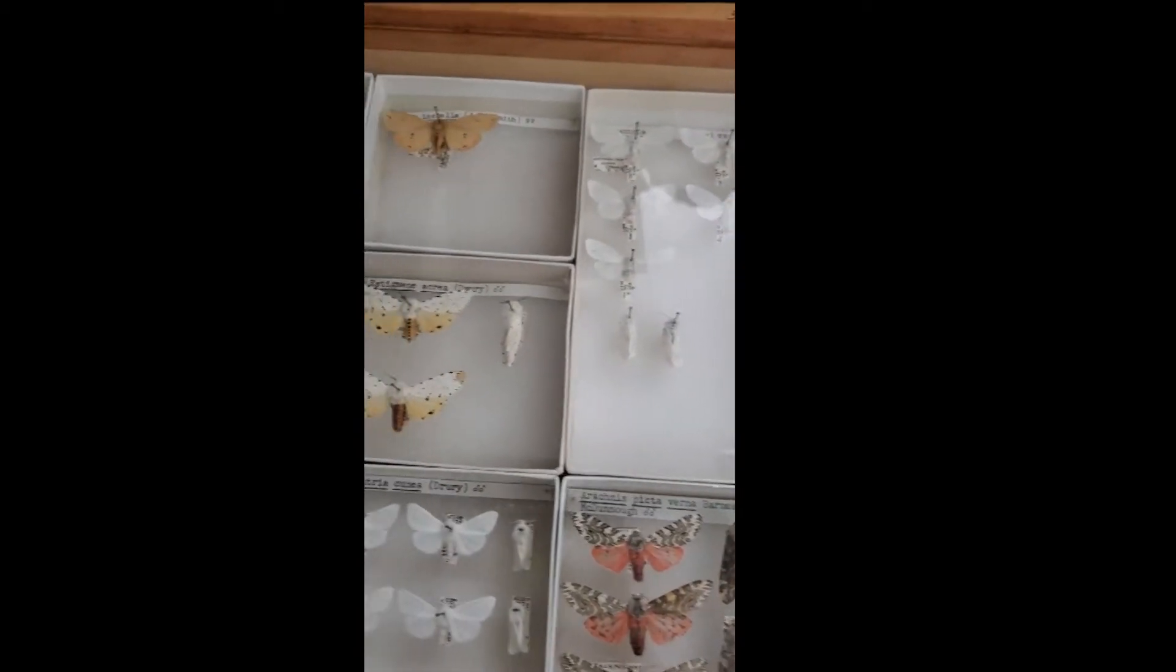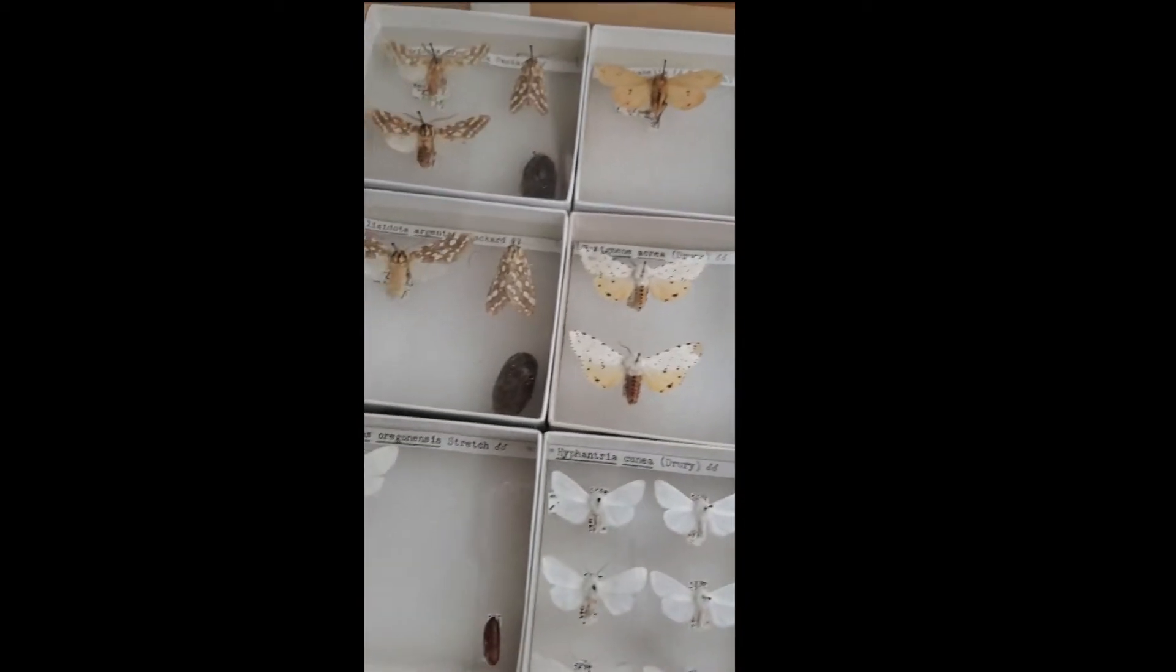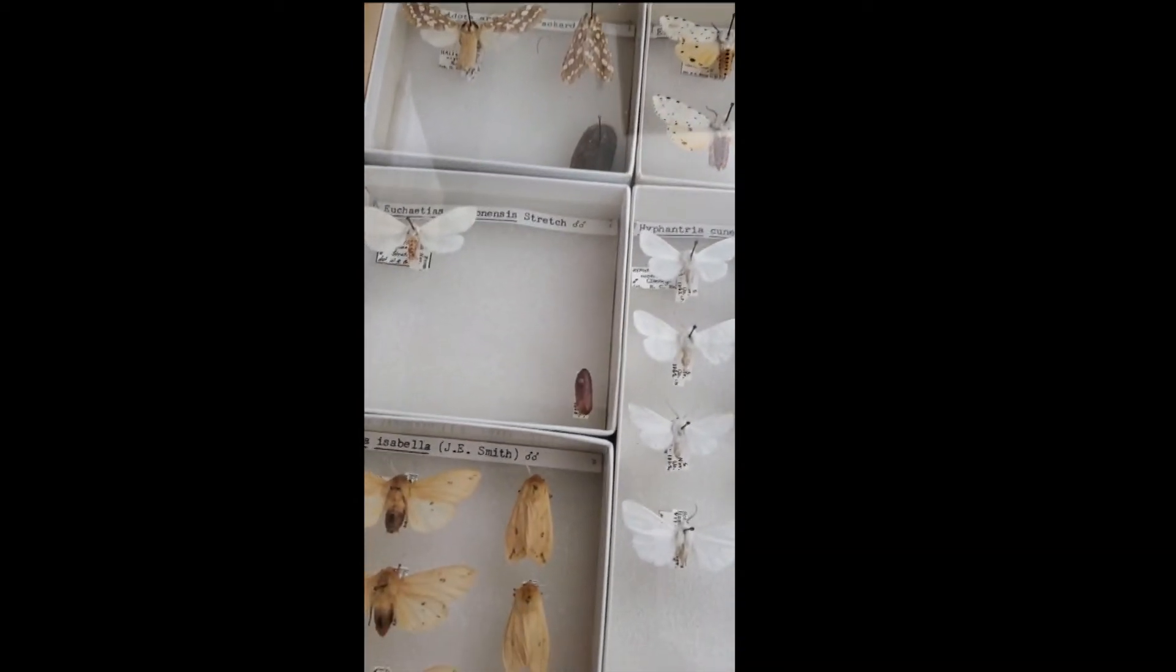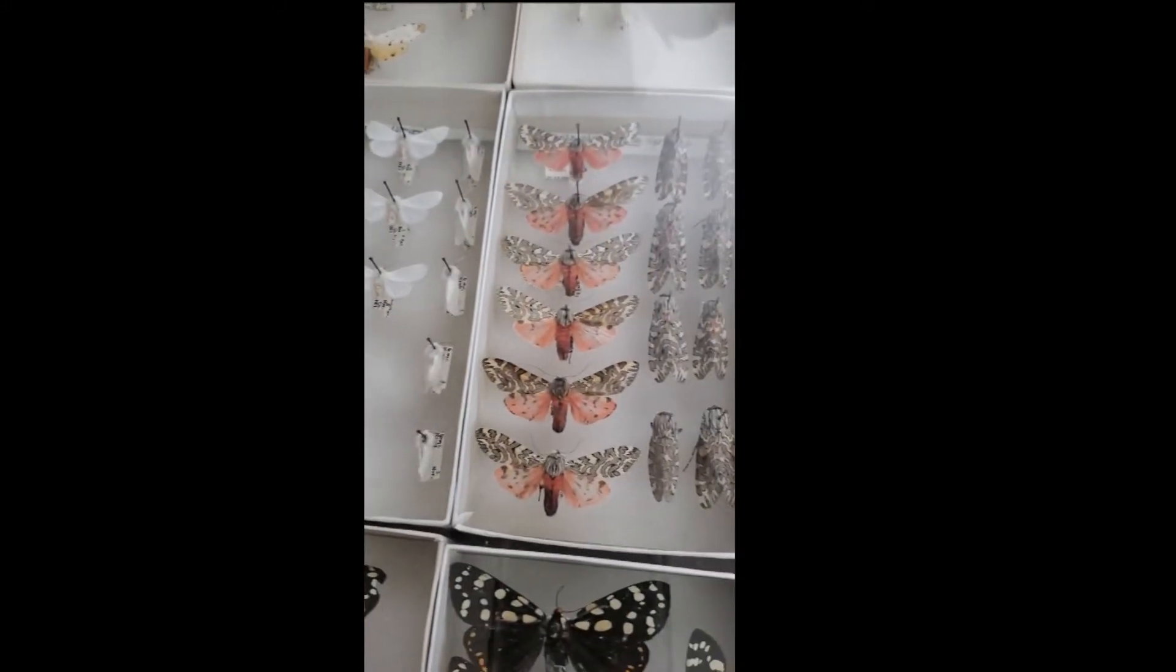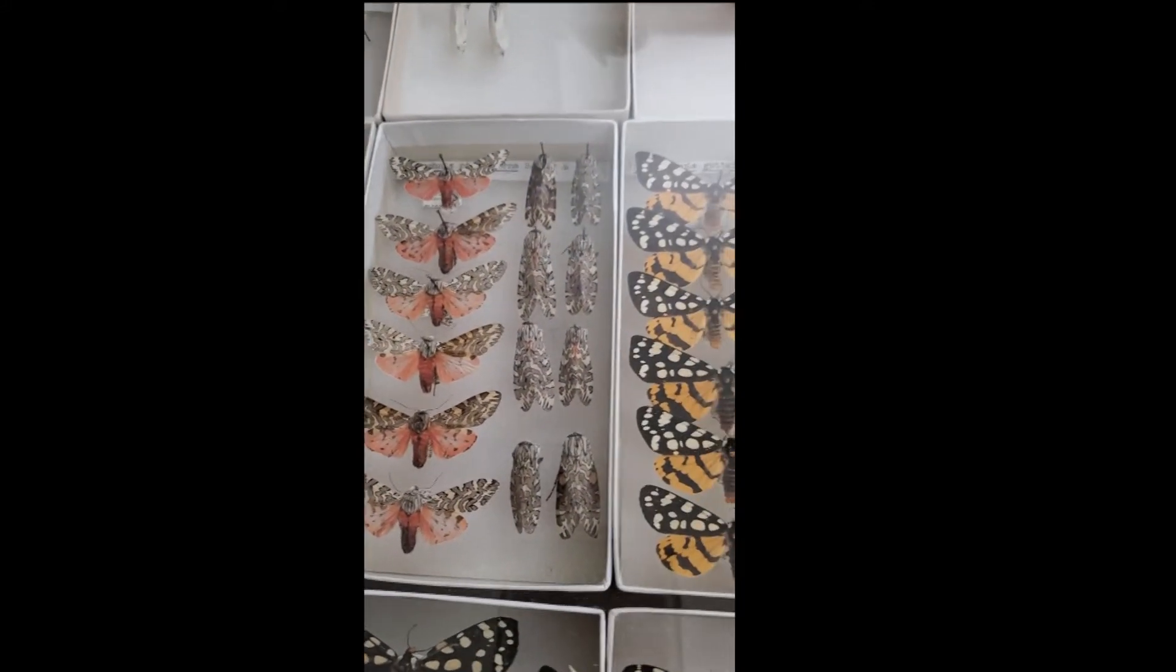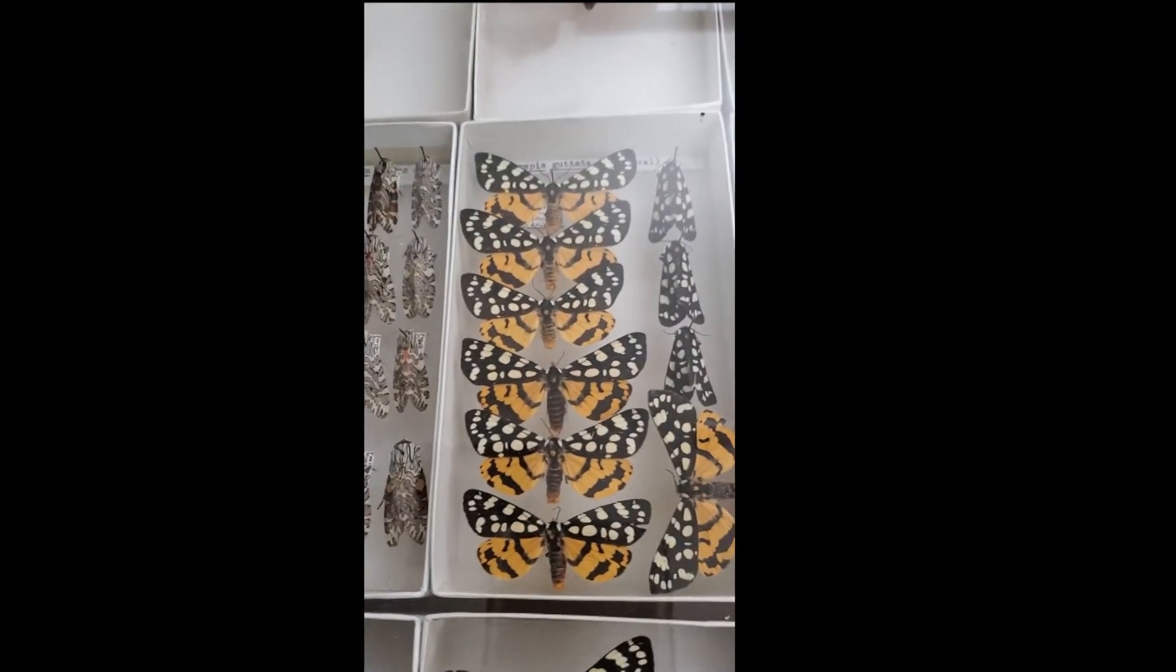We also have some butterflies and moths. These are tiger moths or ones that come from woolly bear caterpillars. And they, again, come from all over the state. You notice on these, on the butterflies and moths, we mount them with their wings spread.